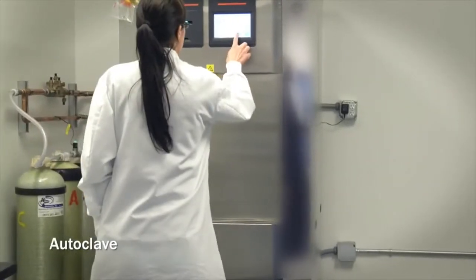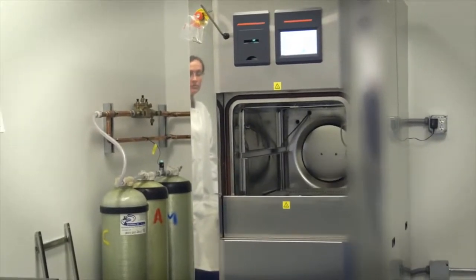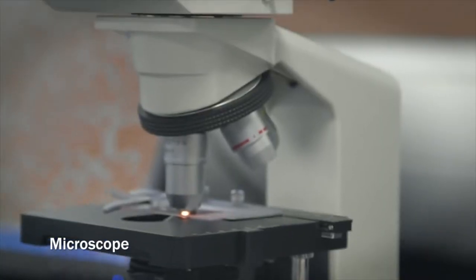The autoclave is a very important and unique instrument in every microbiology lab. What that does is it sterilizes the media used for testing microorganisms, as well as sterilized product that has been tested. We also have a microscope in the microbiology lab which we use for identifying microorganisms that we may see or grow on some of our petri dishes.